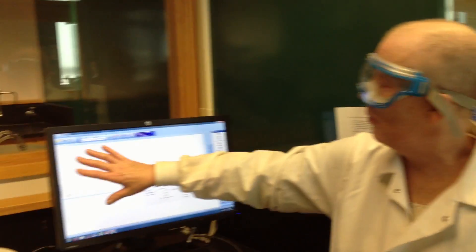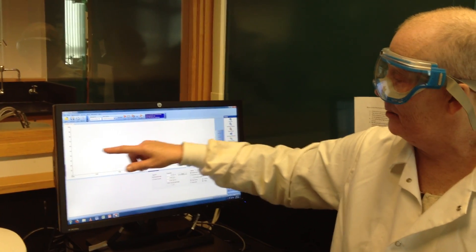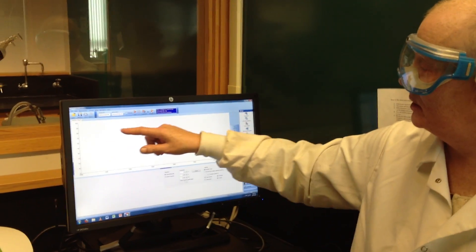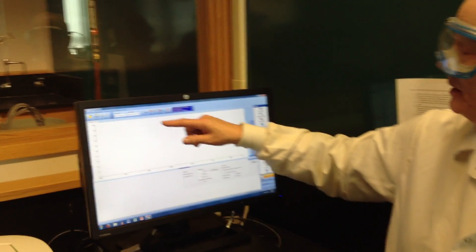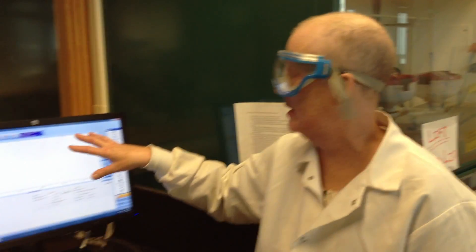A water spectrum essentially has several peaks over here, like around 3,500. It'll have some peaks at about 2,200, which are from CO2, and then it'll have some bending vibrations. You'll learn more about this in classroom water over here. Again, I find with this new instrument, they're relatively minor because the instrument is extremely well sealed.